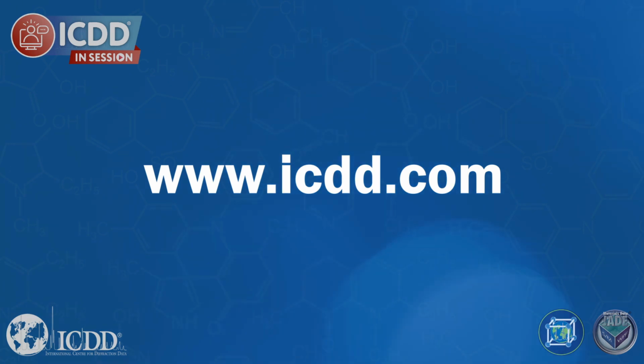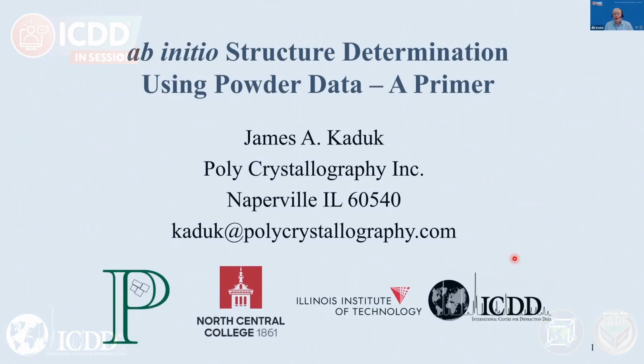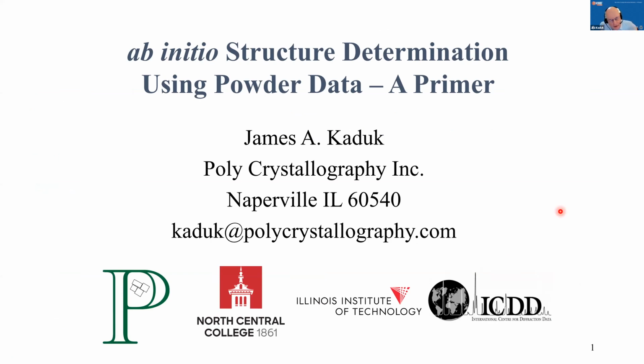Let me add my welcome to everybody to this month's webinar. Ab initio is Latin for from the beginning, and it's the jargon people use to talk about solving the crystal structure from powder data. So today I'd like to give a high level and fairly quick, I admit, introduction to what life is like when your answer isn't in the powder diffraction file.